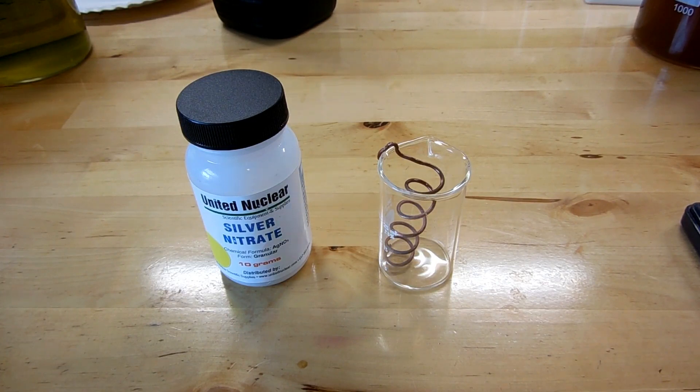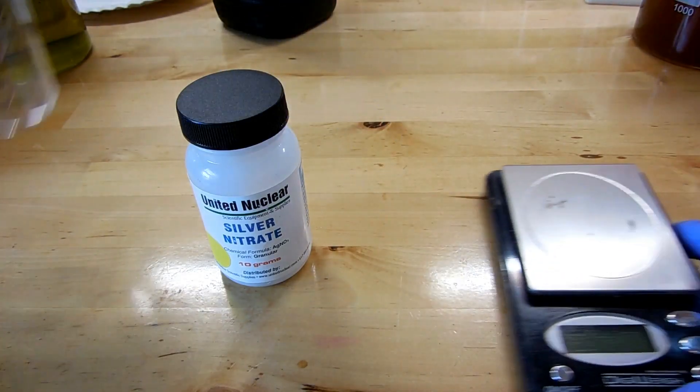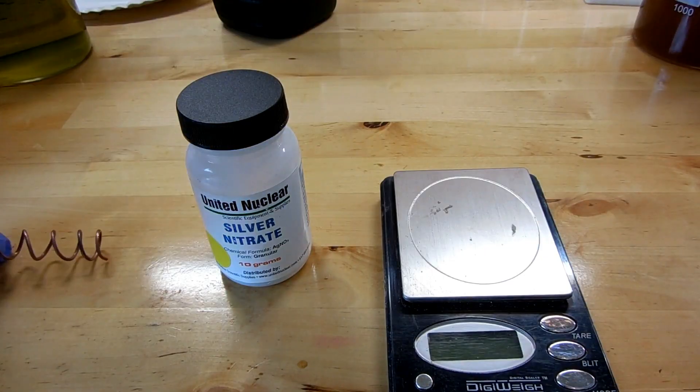Now, with my experiment, I'm going to aim to produce one gram of silver metal at the end of this. So I've calculated that I'm going to need 1.6 grams of silver nitrate, which I'll weigh out right now.